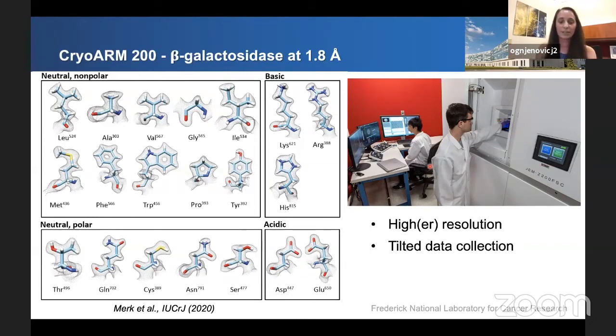Another important question we are getting is if it is possible to collect higher quality data with a tilted stage on the Cryo ARM, whether it is tomography tilt series data or even just tilted single particle data, which of course is sometimes needed to overcome a preferred orientation problem. And David Bell actually has shown some nice tilt series collected on their Cryo ARM 300 microscope in Glasgow. So we are looking forward to collecting some tomography data on our Cryo ARM 200 microscope as well. Taku wrote all the scripts, and we hope to do this soon.